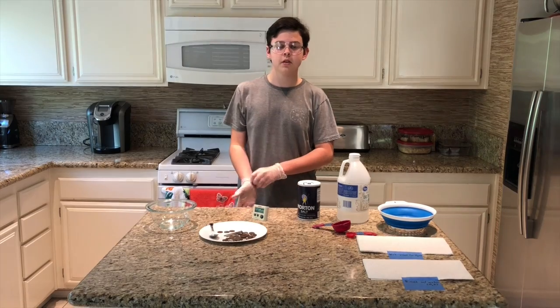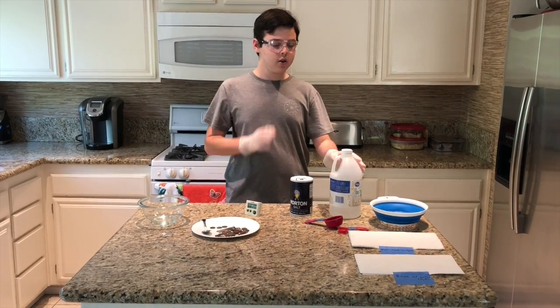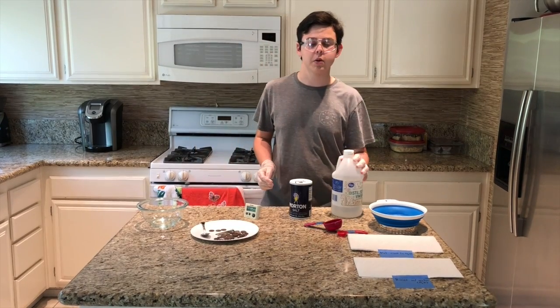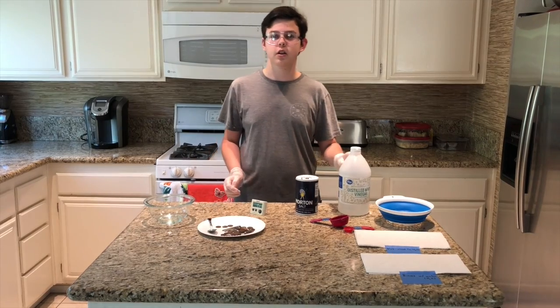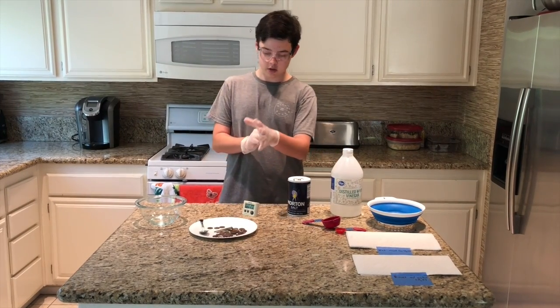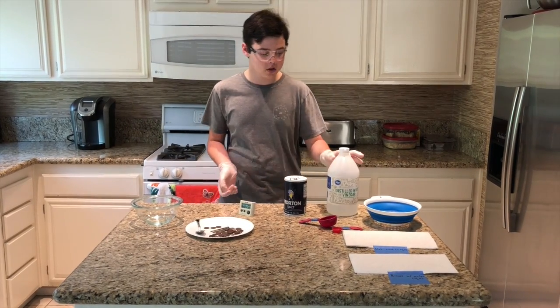So as for safety procedures in this lab, I'm wearing goggles because, say if this vinegar were to splash into my eyes, it would probably sting a bit, and it's never a good idea to get chemicals on contact with your skin, so that's why I'm wearing the gloves, also to minimize contamination of the solution.